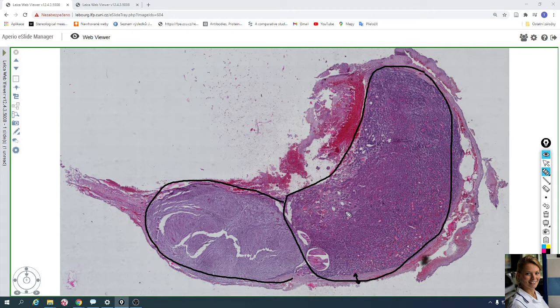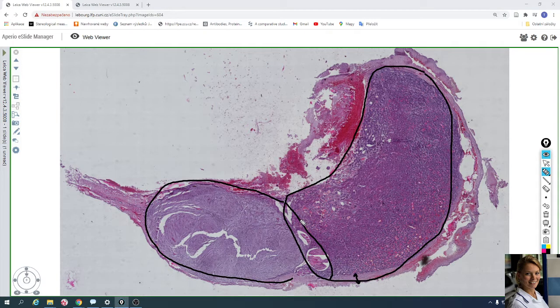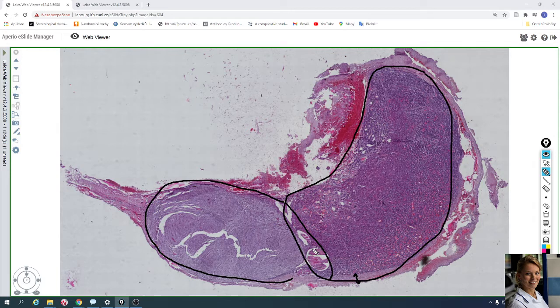Here is the adenohypophysis — the anterior lobe — and the posterior lobe. In between them is a space called the pars intermedia, with Rathke's follicles containing colloid.